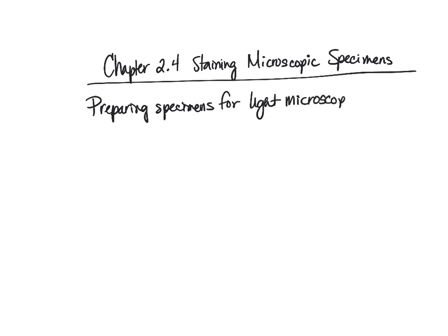So when we are preparing specimens for light microscopy, there are two ways that we can do this. There's the wet mount and then there's fixation.